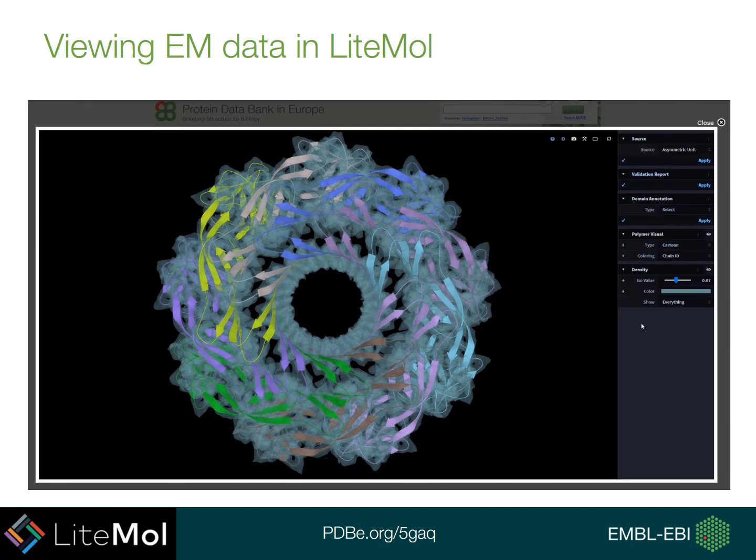There are also a number of extra controls you can add on the right-hand side. For instance, if you wanted to apply a validation report, you can do this using this button here. If you want to control the density or maybe turn off the map, you can do this using the I button. There's also the option to change the view of the polymer as well.